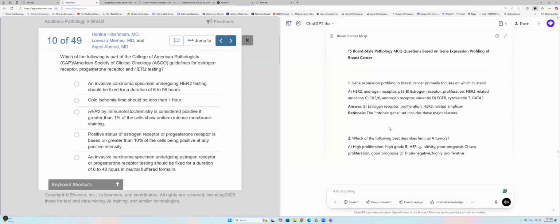Once the tissue is removed, whether it's in formalin or not, you have to bring it to the lab fast. There's a courier service that brings it. Sometimes, if you have a breast cancer surgery that's running late, the resident that's on call will not even go home. We're waiting for the breast. As soon as it arrives, you pick it up and prepare it.